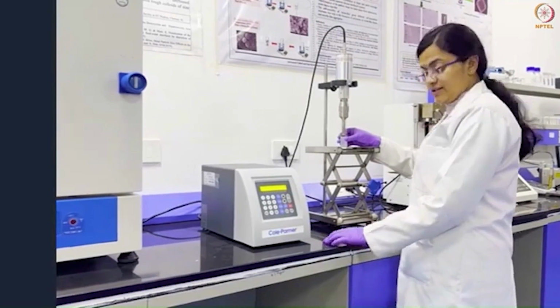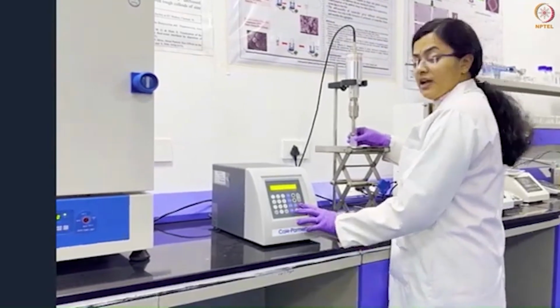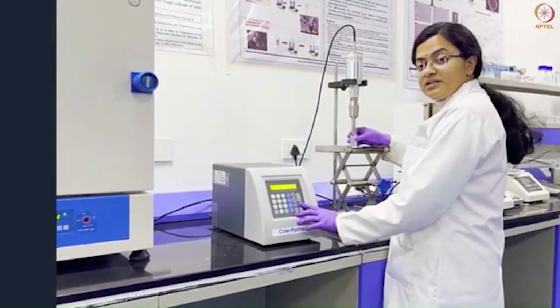Now we'll switch on this equipment and wait for about 1 to 2 minutes.